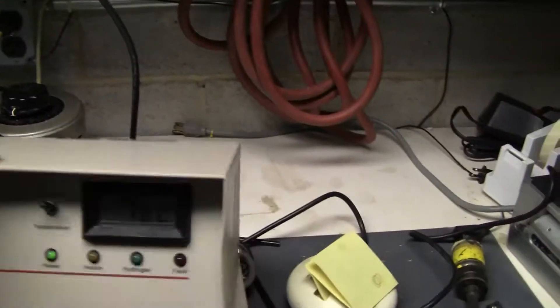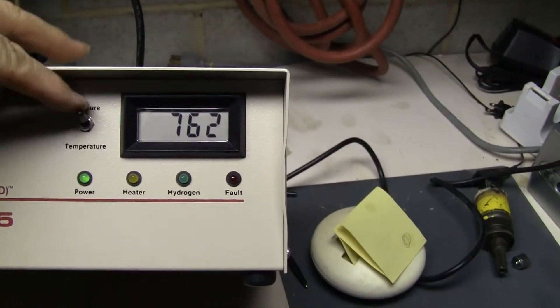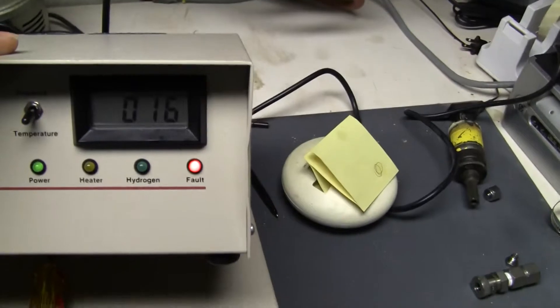We're going to tilt this up so you can see that it's reading 762. And then the temperature — we hooked up a K-thermocouple. The K-thermocouple does not come with it, but it's reading a fault.